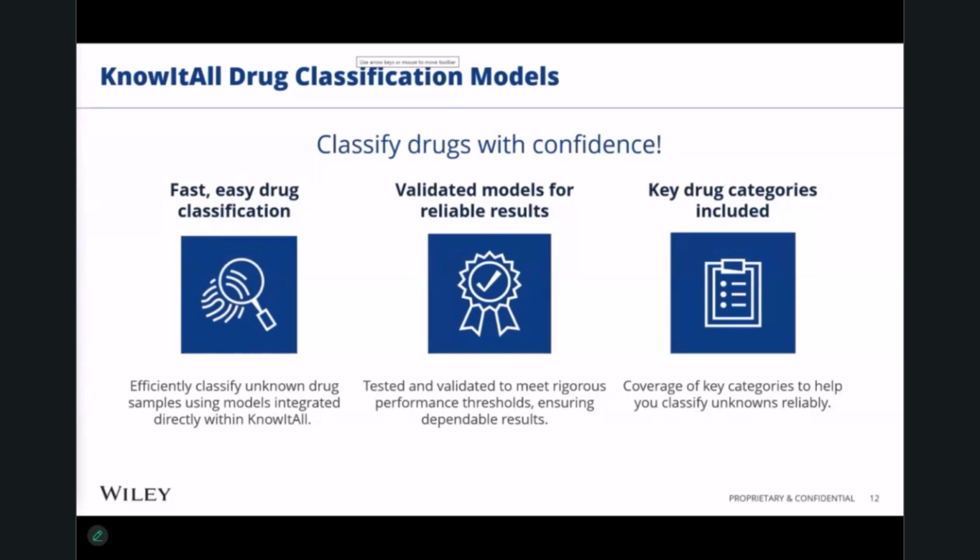Since the models are locally installed, they are extremely quick and do not require a connection to the internet. The classification models were cross-validated multiple times in testing to ensure that they work correctly, and their current coverage is key drug categories. In the future, we may look to expand and include some different classifications as well.